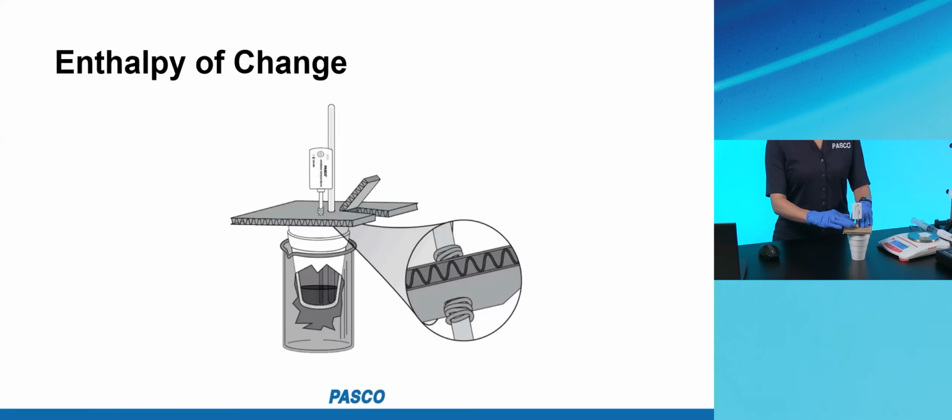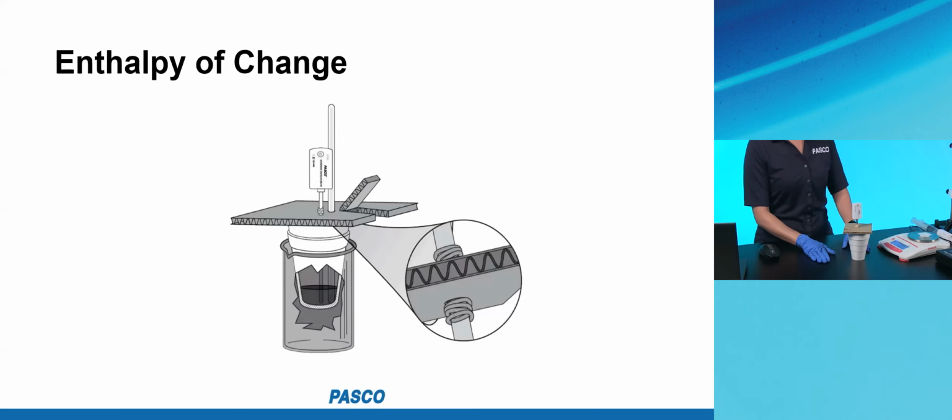I've already got about 25 milliliters of water inside my calorimeter. I've got a little flap cut open on my cardboard cover for my 2 foam cup calorimeter here, so that I don't have to take the lid off and maybe add error, since the water is going to be evaporating off the end of the probe. So by making the flap, I can make it easy to deliver the solid into solution and minimize error. So minimizing error is the theme with the setup here.